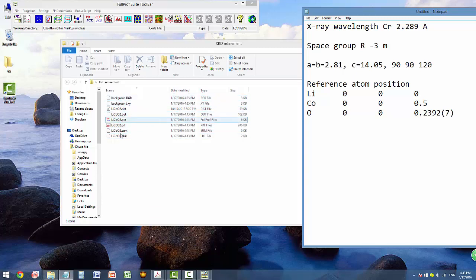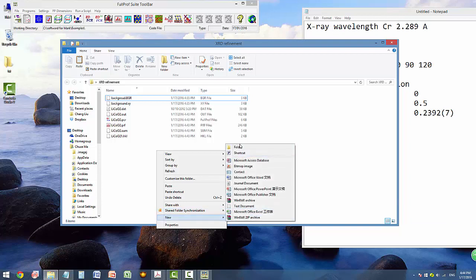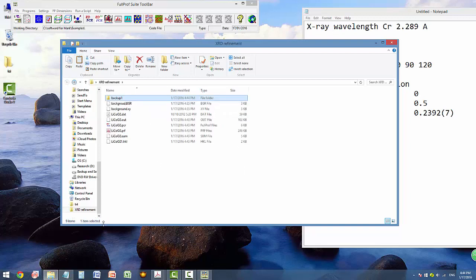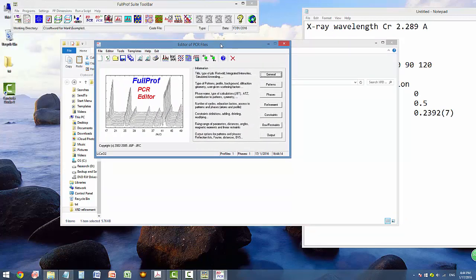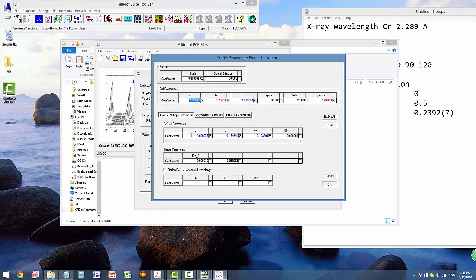I would recommend you back up all the things we have so far. Okay, so this is the backup, in case you mess it up or have some crash, which I think you probably already experienced. Normally when we do the UVW refinement, it's not as smooth as I just showed you.